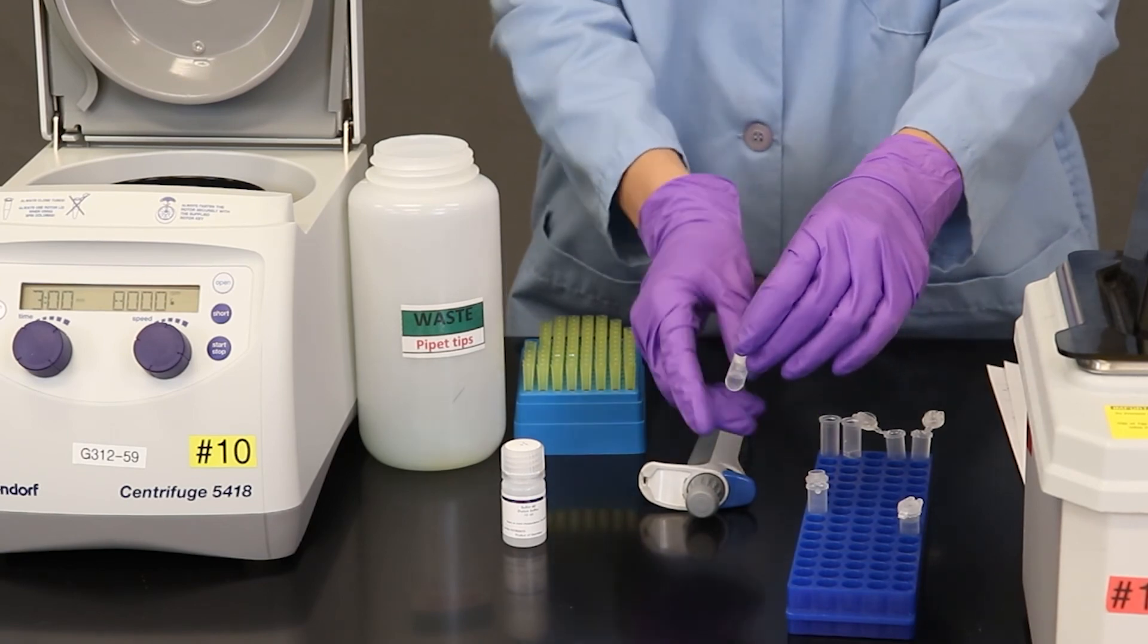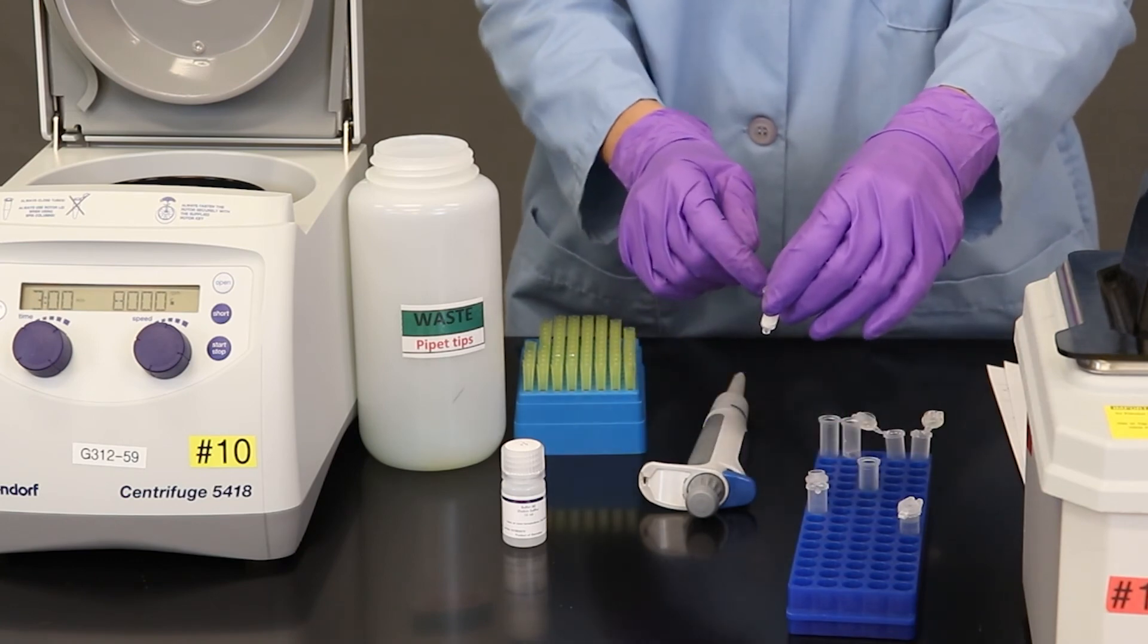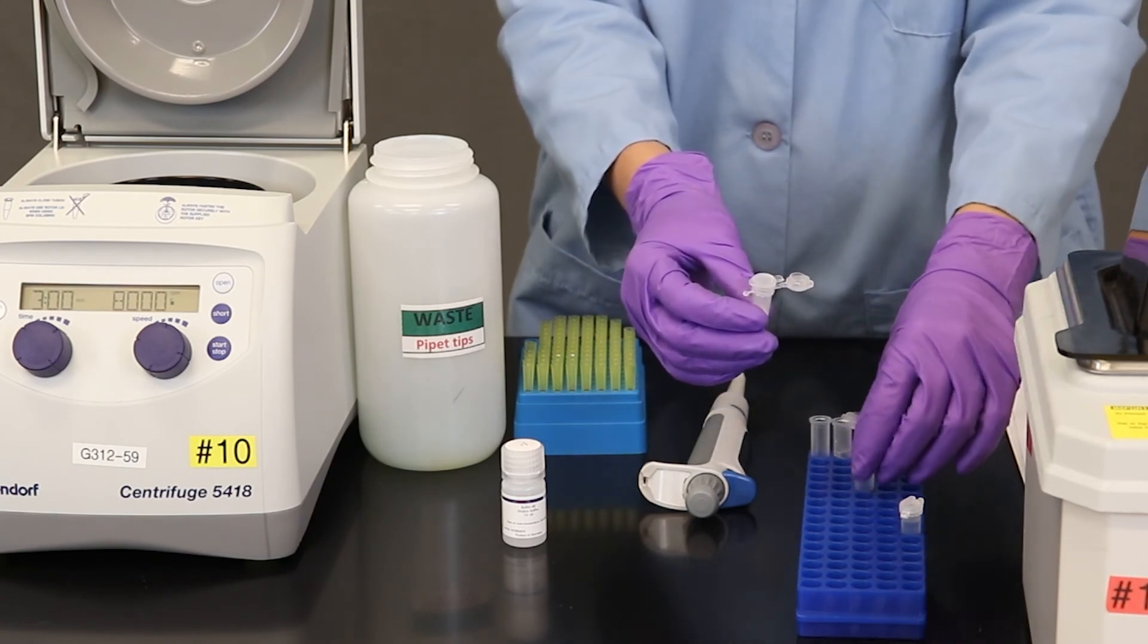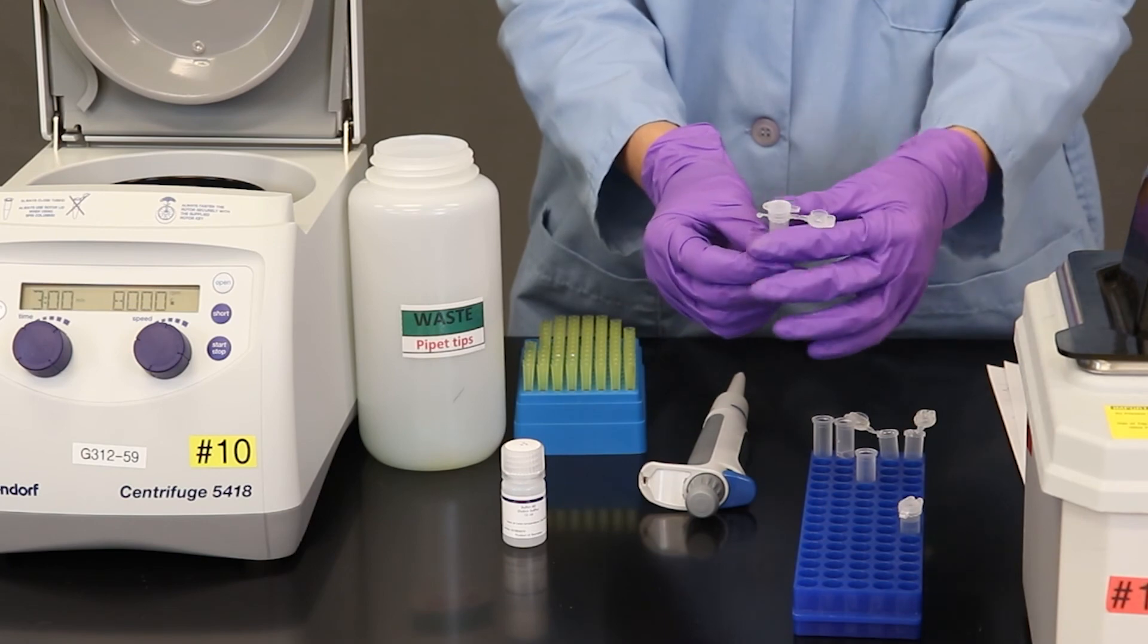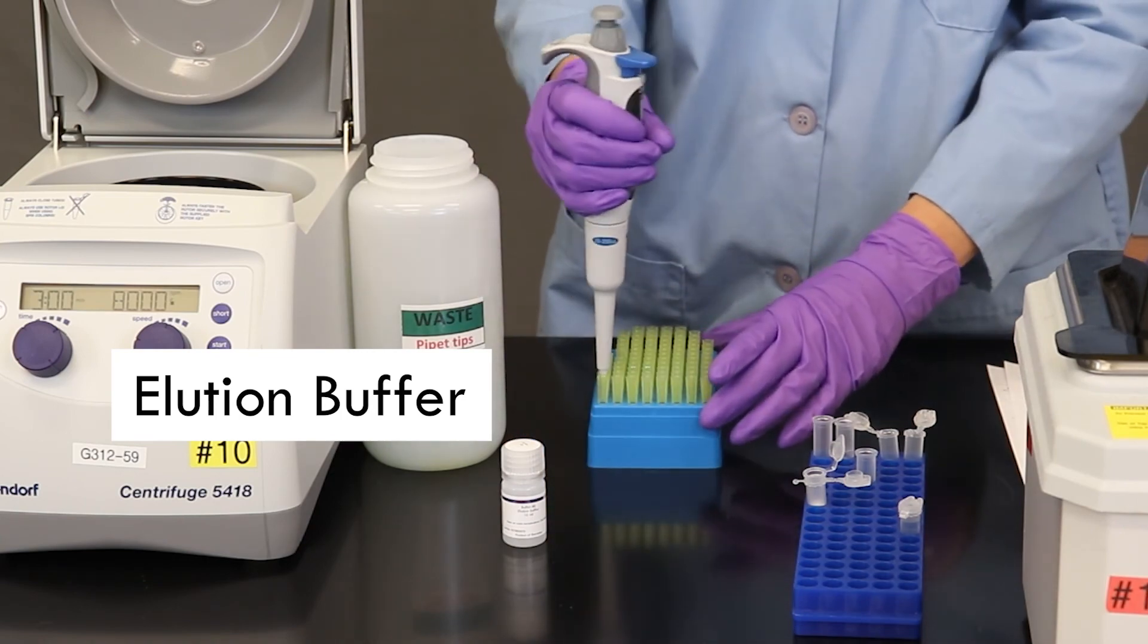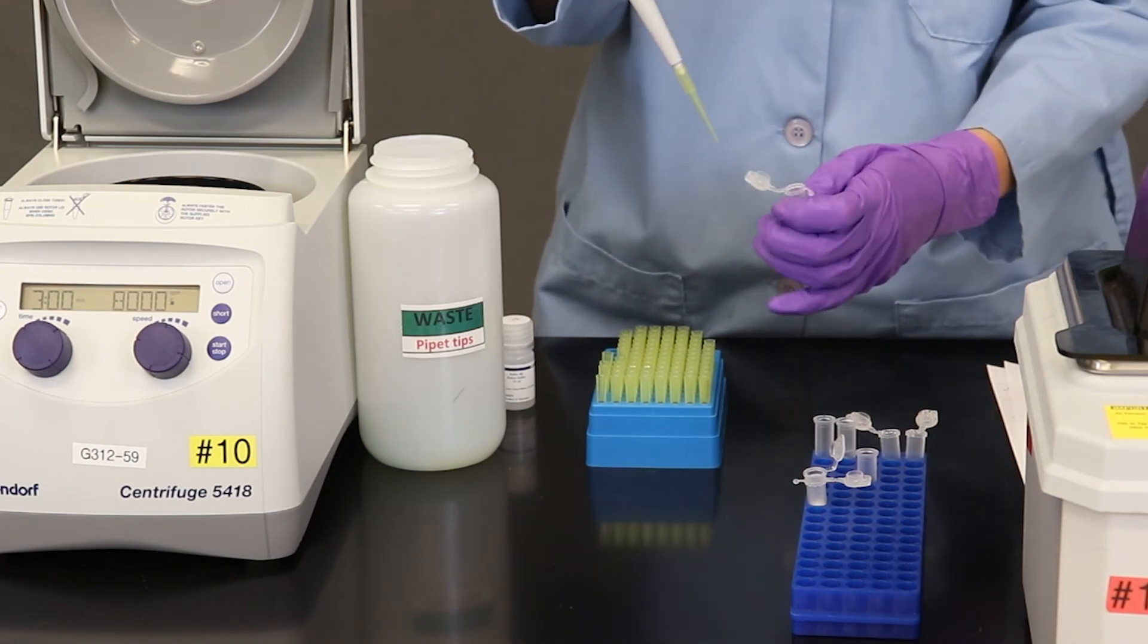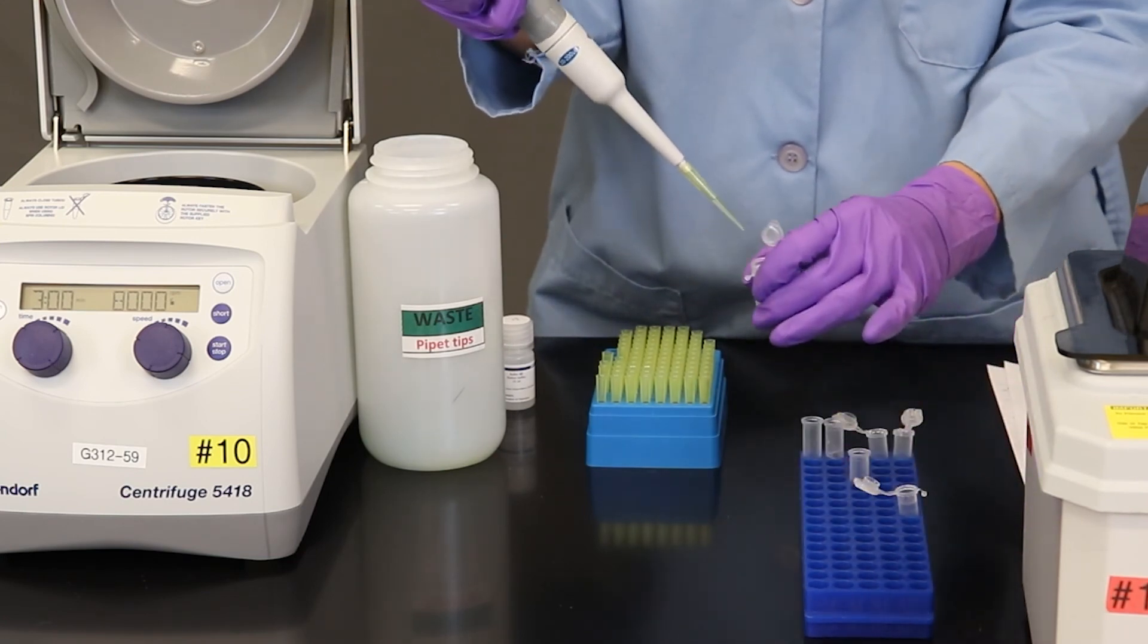So now we have the mini column and it is purified and the DNA is still in the column. The next step we're going to do is to elute or get the DNA out of the column. So I'm going to take off the previous tube and instead of putting it in one of these collection tubes, I'm going to put it in a regular microfuge tube where I can store my sample. So I'm going to put 60 microliters of this elution buffer. And I'll pipette that in and then I will put it into the centrifuge.